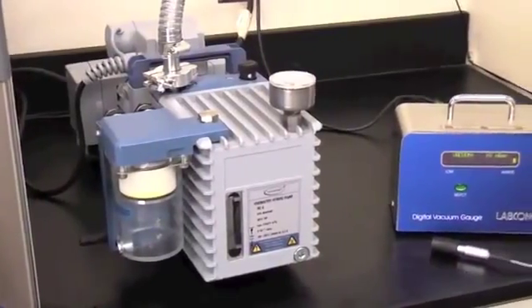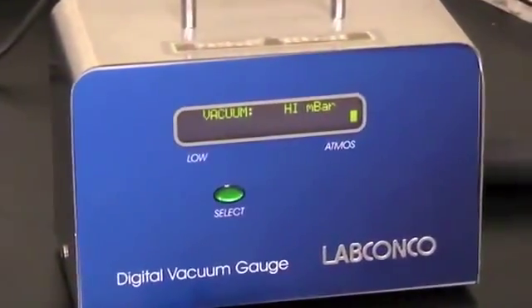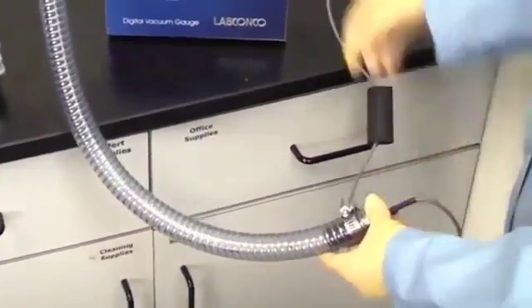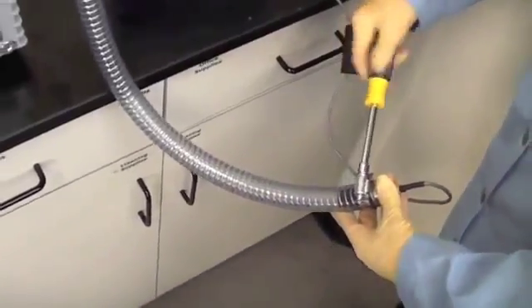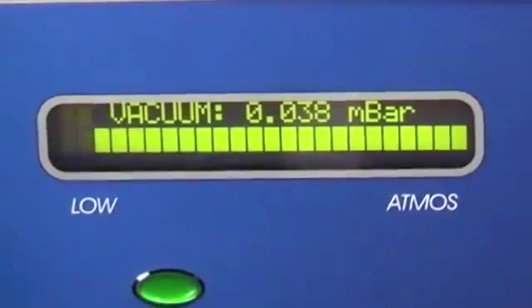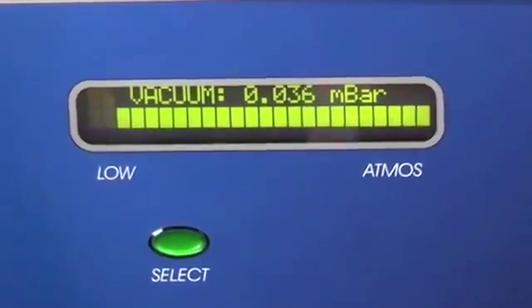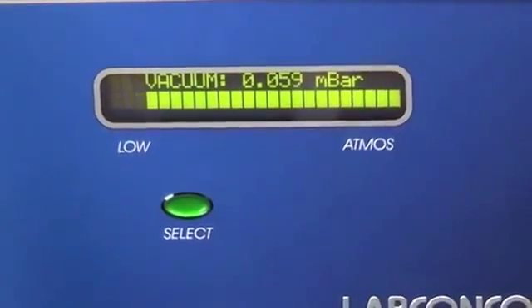If vacuum problems continue, a second vacuum gauge capable of reading 0.033 millibars may be required to determine if the vacuum pump is good. Isolate the pump by disconnecting the vacuum hose from the freeze-dry system, insert the vacuum sensor from a secondary vacuum gauge into the end of the vacuum hose, and observe the vacuum reading. Confirm that the pump is capable of achieving an ultimate vacuum less than 10×10⁻³ millibars, or approximately 10 microns.